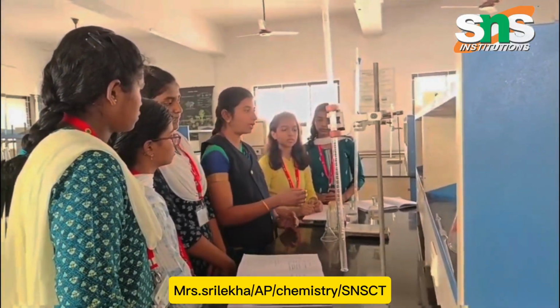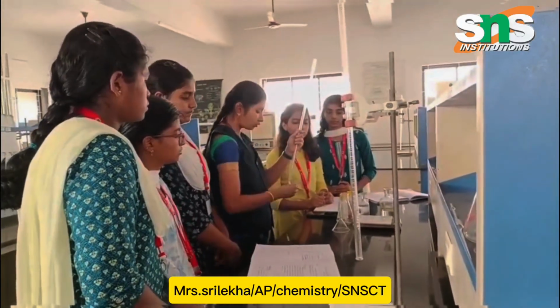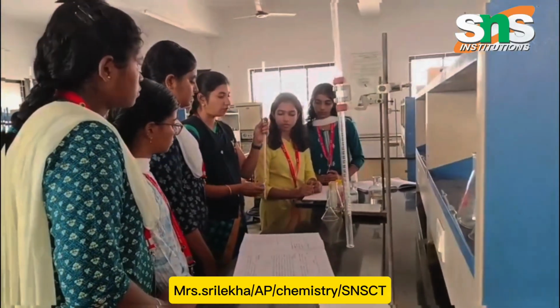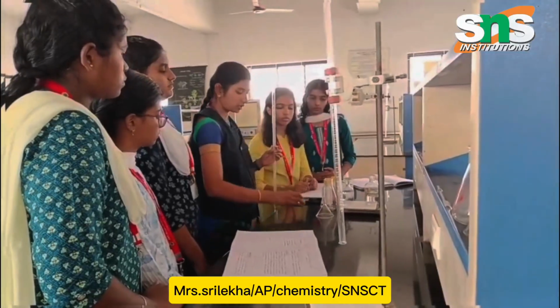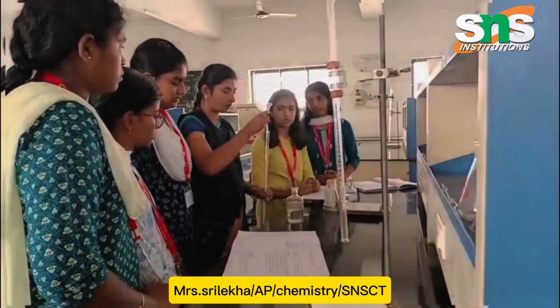Okay. Now I am adding the burette solution, HCl, into the burette. We have to mix the burette solution, take the HCl solution in the burette and add it through the funnel.